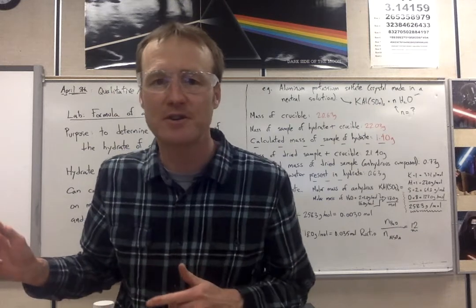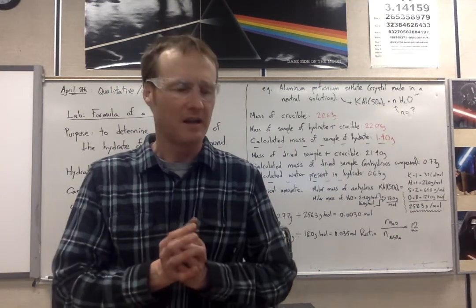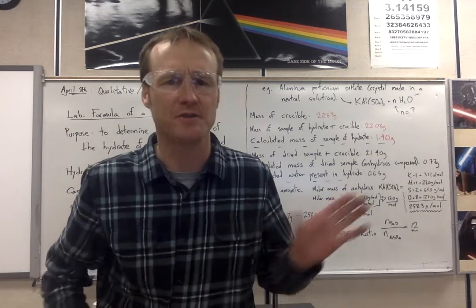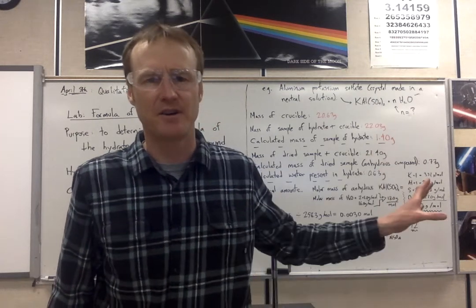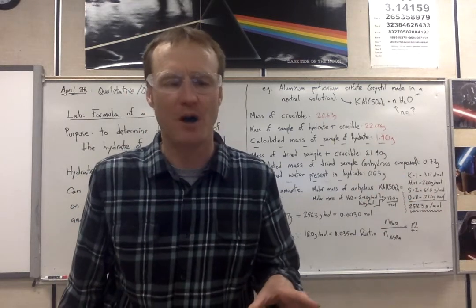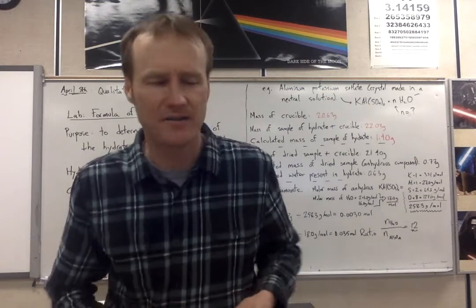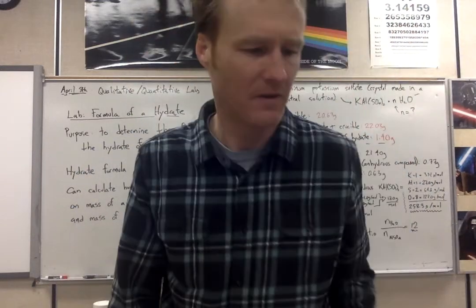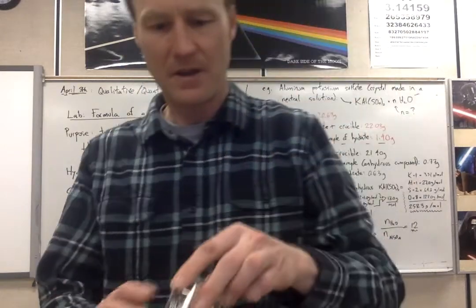We're next going to do this with copper sulfate. For this, I'm going to rely on you to use the same kind of steps that I used when I just demonstrated the lab with this material, but we're going to do it with copper. There might be a bit of lag time in this video. I don't know how to edit these things, so you have to be patient. This is the crystal of copper right here.